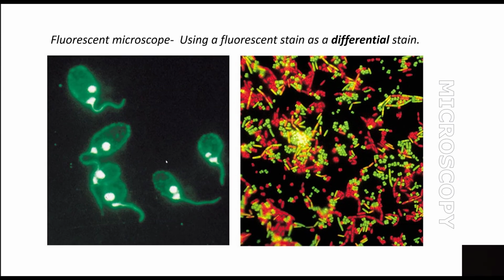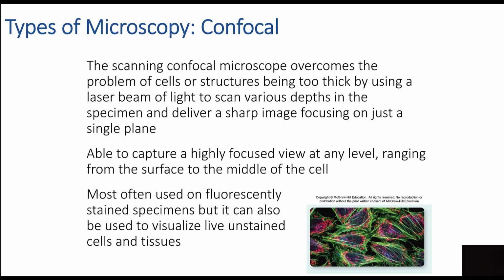But in a microbiology type lab, we can use it to differentiate between two different types of bacteria, as you can see here, or identify a pathogen using the types of fluorescence tagged antibodies.